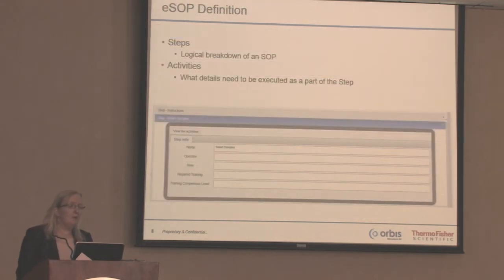Then, as I said, with your SOP, you can import an SOP into the lab execution system. You can display that full SOP, and then you can break that SOP down into steps, which is your eSOP, so that you have your steps defined. As you define your step, you can say what activities are required for that step, and also how that step is displayed within the LES screen for the user.